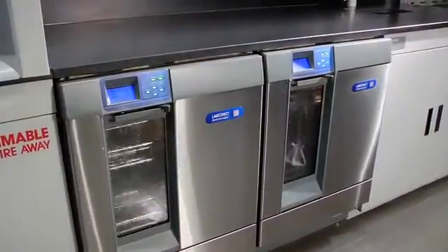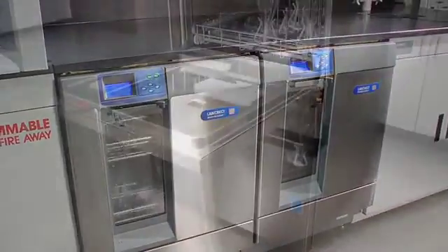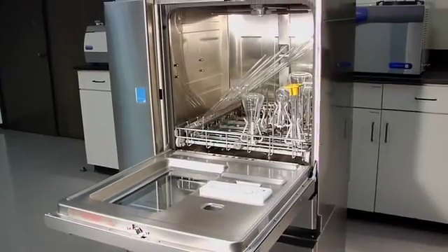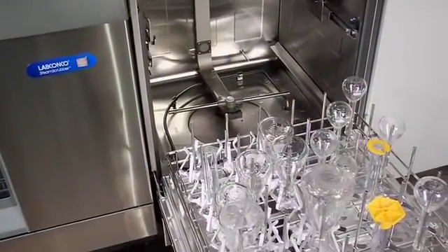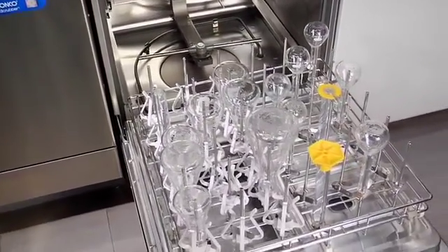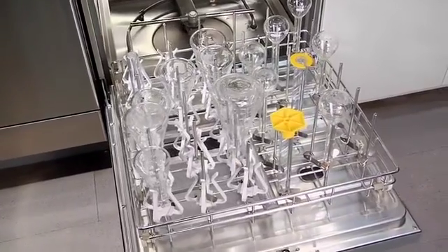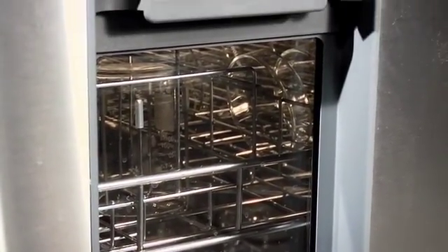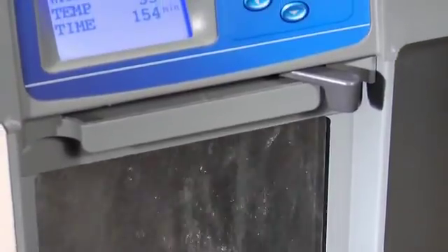Built-in options are offered on selected models. These include high heat programs on 230-volt models that reach 199 degrees Fahrenheit to sanitize glassware and effectively remove lipids, tars, and waxes. A viewing window with an interior light lets you see cycles in progress. This feature comes standard on the Flask Scrubber Vantage series and is optional on the Steam Scrubber and Flask Scrubber models.